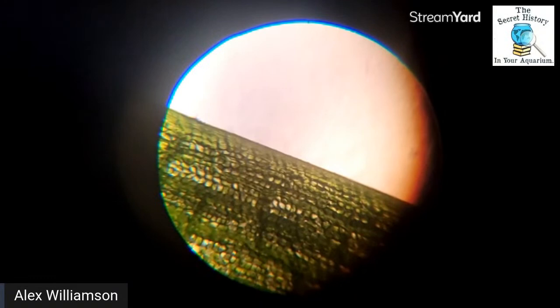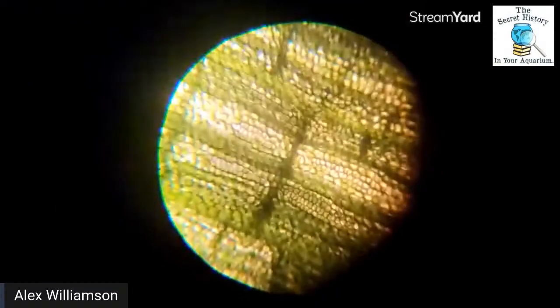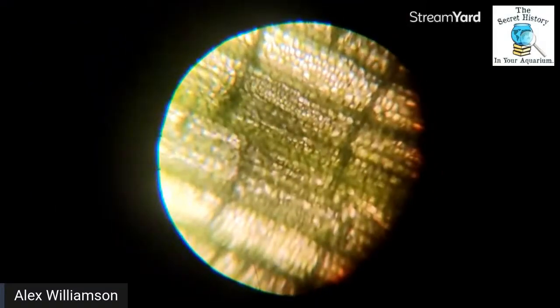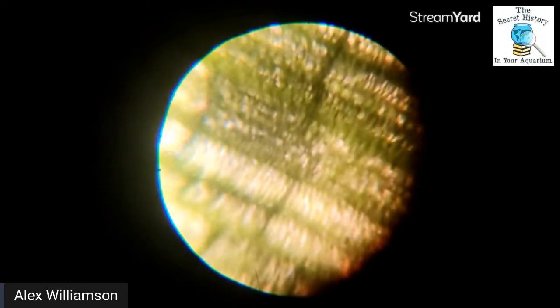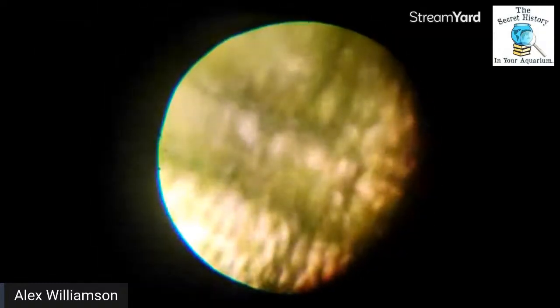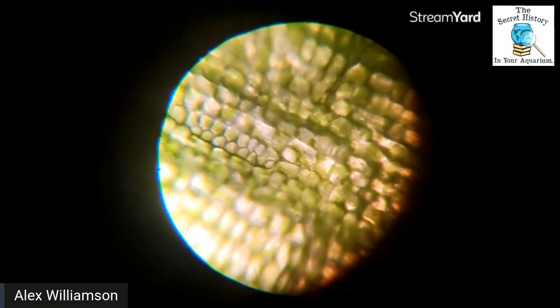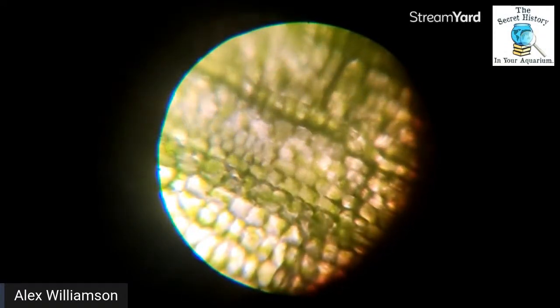But here we've got a grouping of cells. And where are the biggest cells on this thing? All right. So on the biggest ones, if we zoom in, we have to light up all the way, hopefully. We should be able to, yes. So you can see the chloroplast on the lower left. And you can even see a little reddish brown dot in one of the center cells. That's the nucleus.